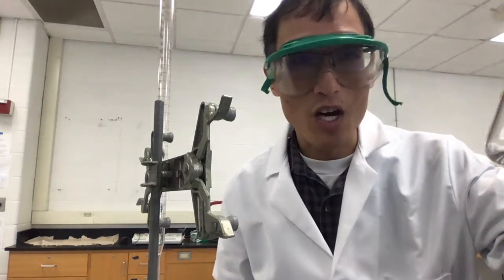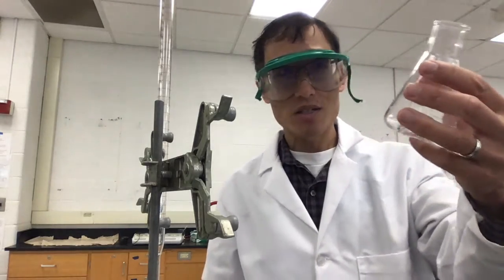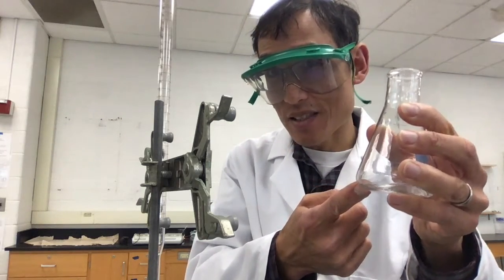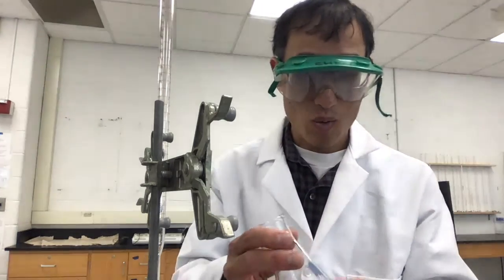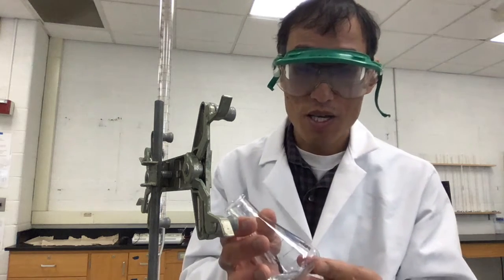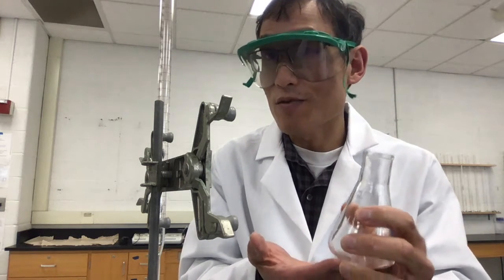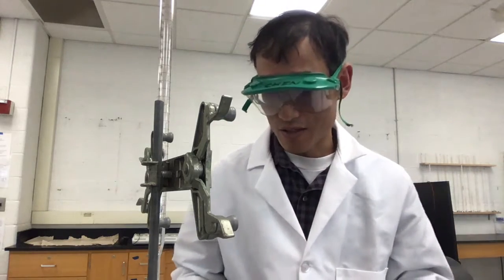If that's not enough volume, you can always add some water, distilled water, because if I add water, am I actually changing the amount of acid that's in there? So that's a question that you can think about. Sometimes acids come in solid form, sometimes they come in aqueous form. And if I dissolve it in water, in different amounts of water, will that make a difference? Think about how many molecules of acid are in here.